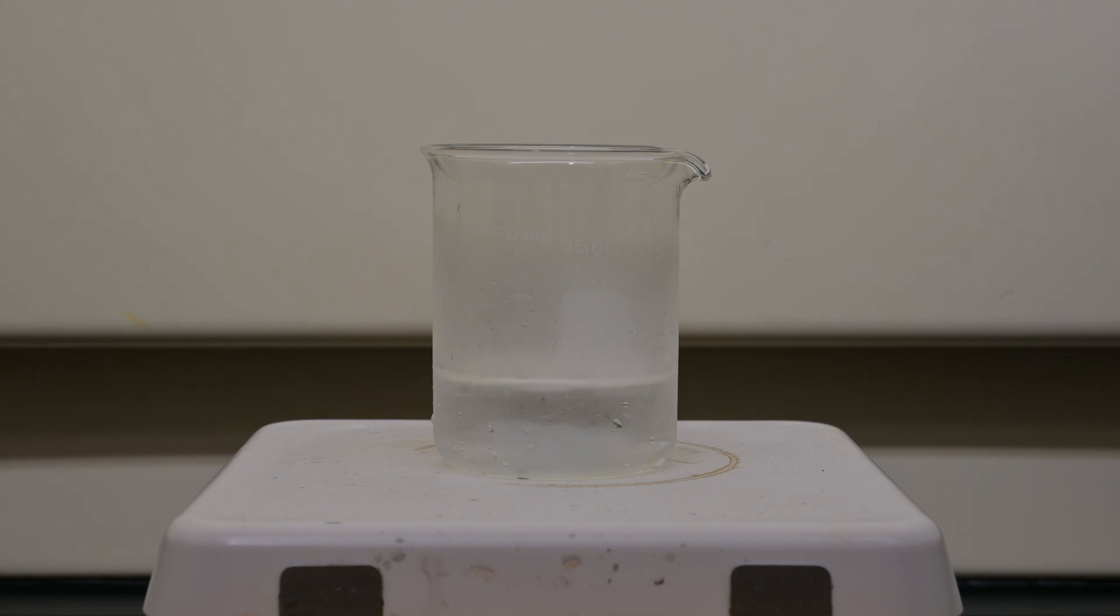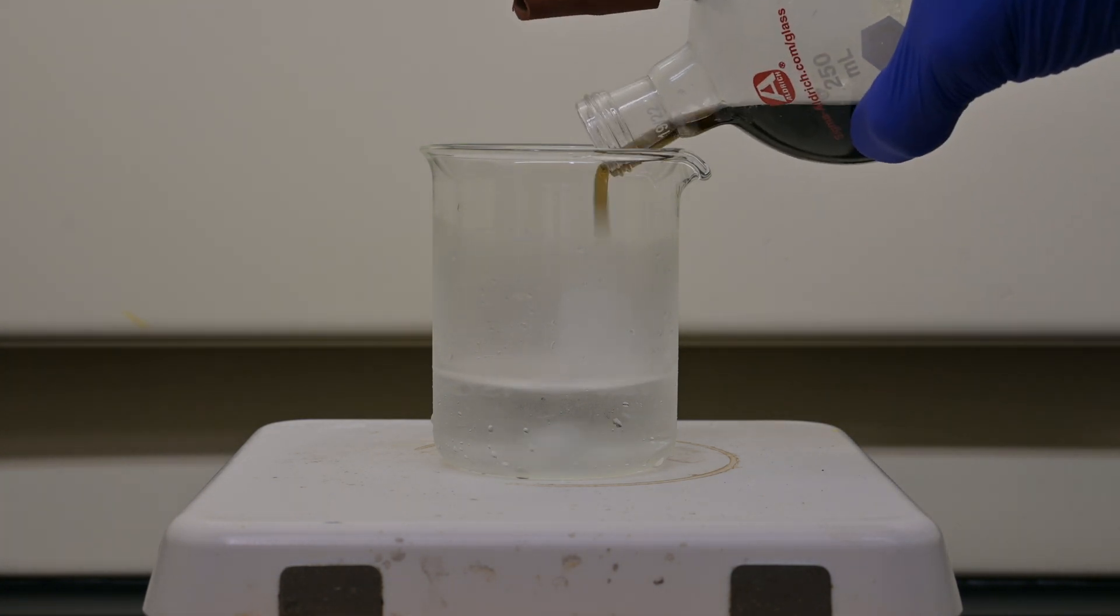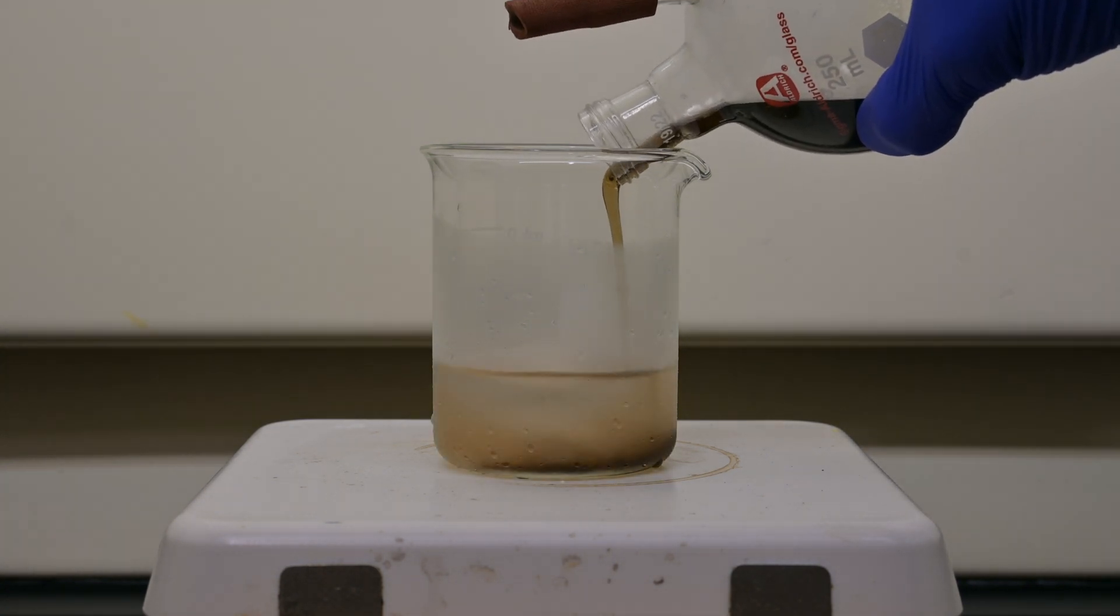Once the reaction is complete, let the mixture cool to room temperature. Once cooled, pour into about 100 milliliters of cold water while stirring. This will precipitate the crude sulfanilic acid as a gray crystalline mass.